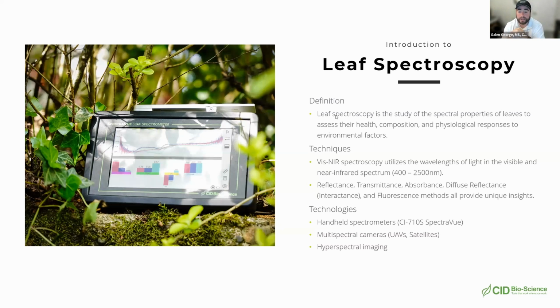So yes, making sure that you're calibrating is definitely of the utmost importance. If you have this device already and you have an instance where you forgot to calibrate, and you need to be able to recover that data, there are potentially ways for us to recover that data. And so if that is the case, you can always reach out to us and see if that is something that we can help you with. But it's just best to remember to calibrate every time that instrument's power cycled.